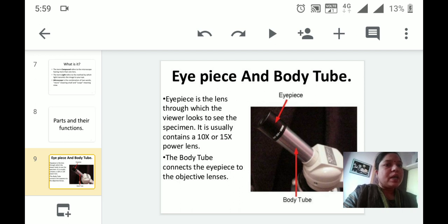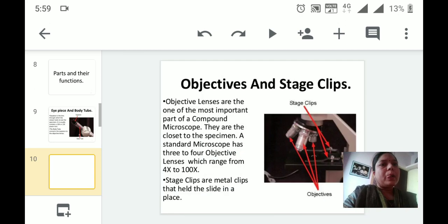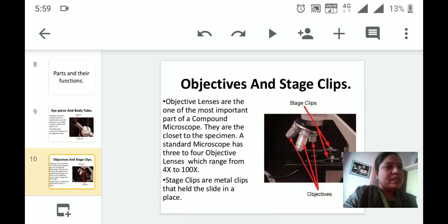Different parts and functions: The eyepiece is a lens through which viewers look to see the specimen. It usually contains 10x or 15x power lenses. In the biology laboratory, we have the 10x eyepiece. The body tube always connects the eyepiece to the objective lens.